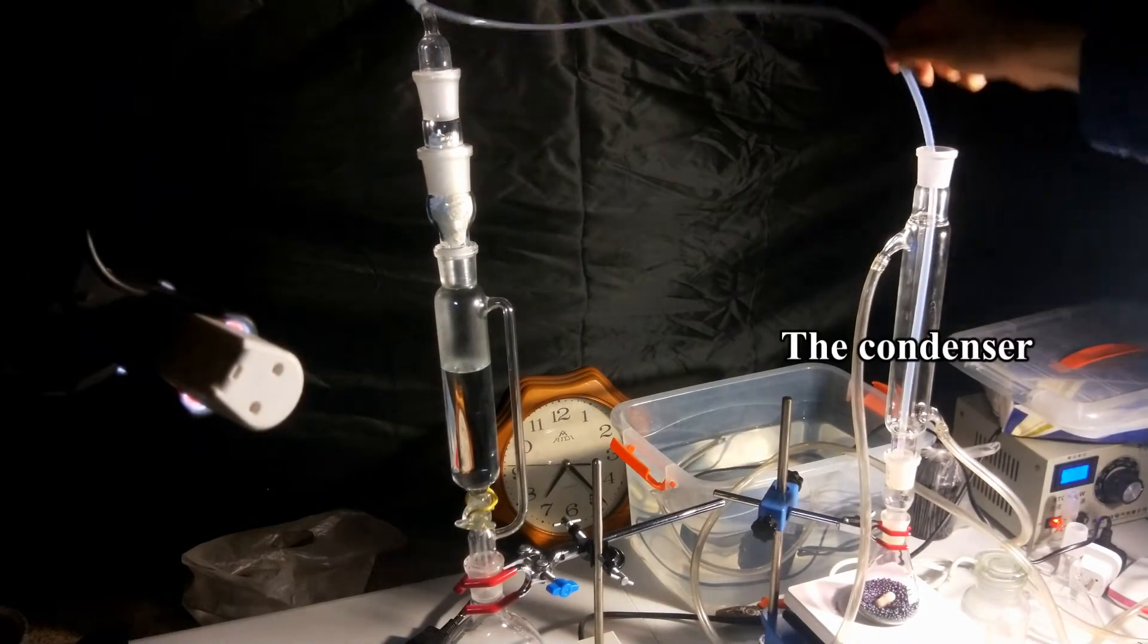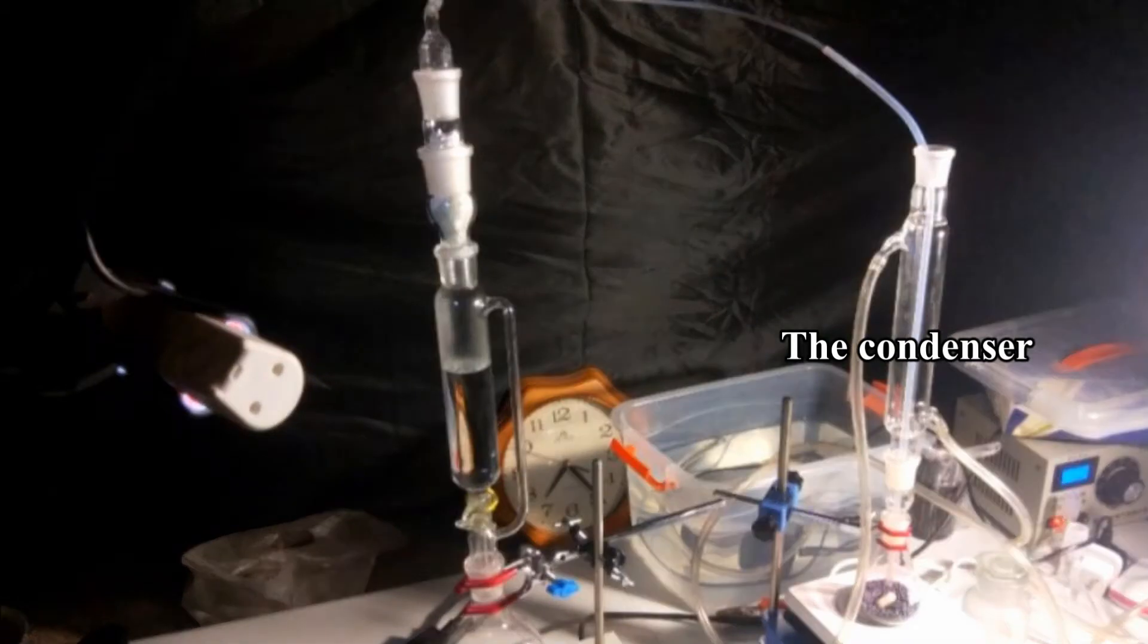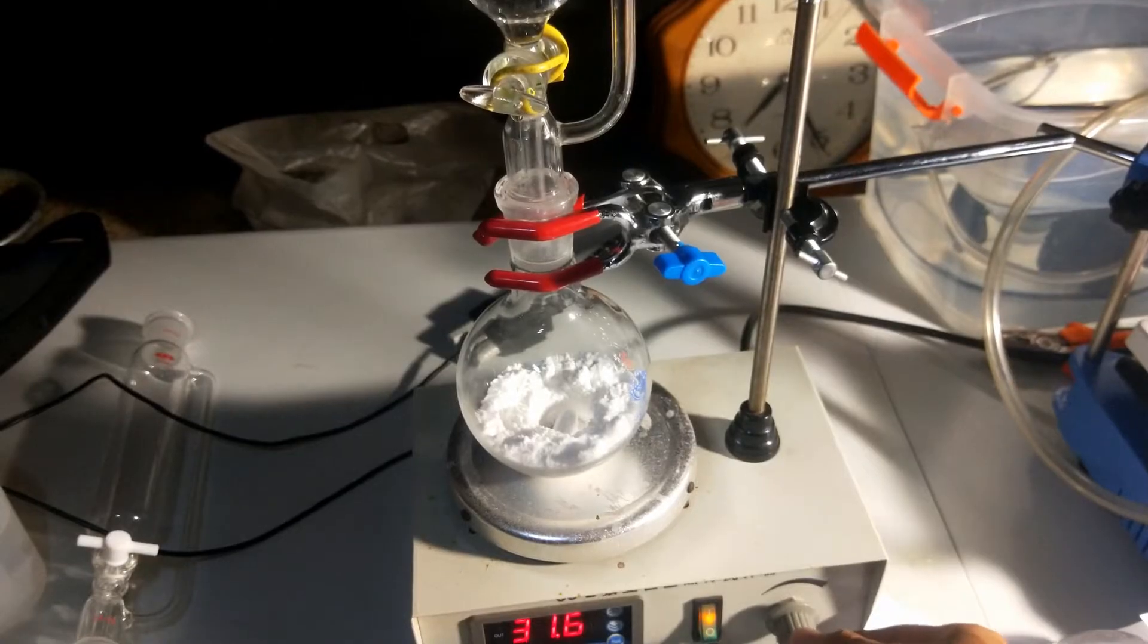That condenser is used as a buffer zone for chlorine gas to have enough time to react with iodine instead of me. Okay, everything is prepared and ready. Let's get started.